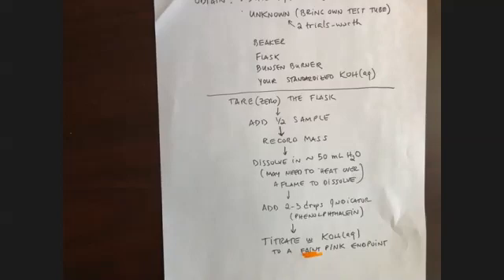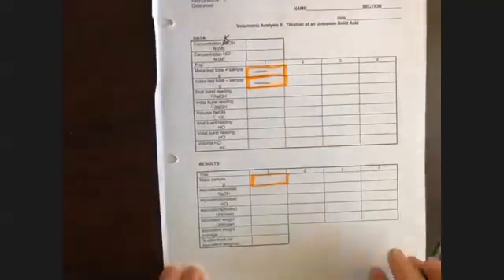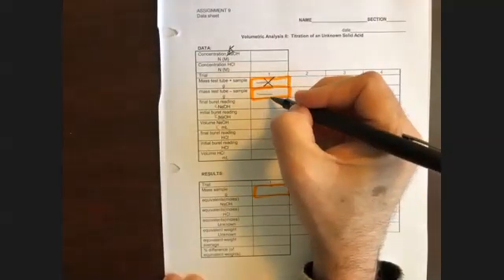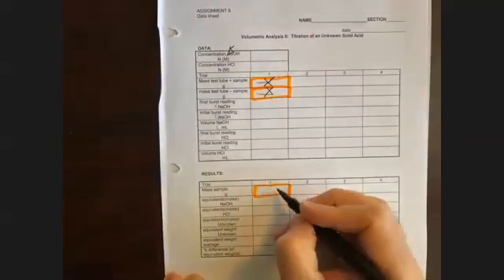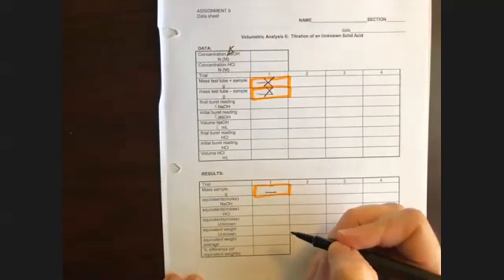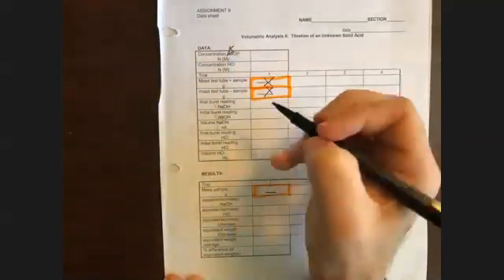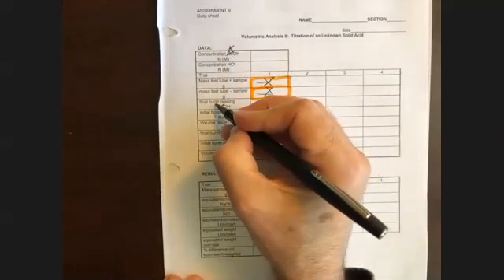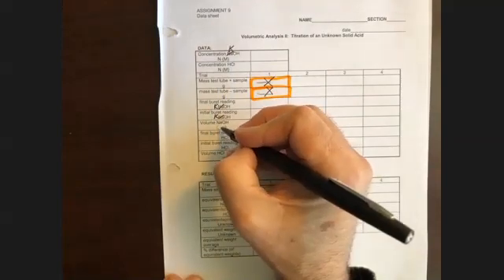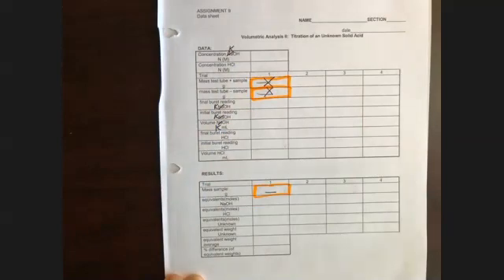So on your data sheet, what you will have is, again, like I said before, you are not going to have this measurement here of the full and the empty test tube. You're going to record your mass of sample directly in here. Notice that we have KOH instead of NaOH, and of course, you're going to start with a certain volume in your burette, and then a final volume, which will allow you to determine what was the volume of KOH that was delivered.